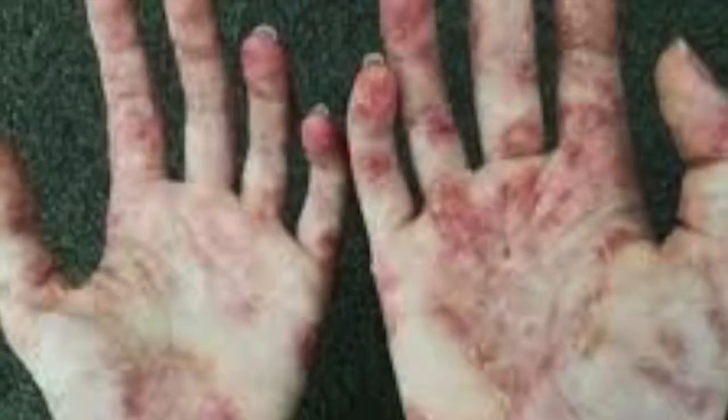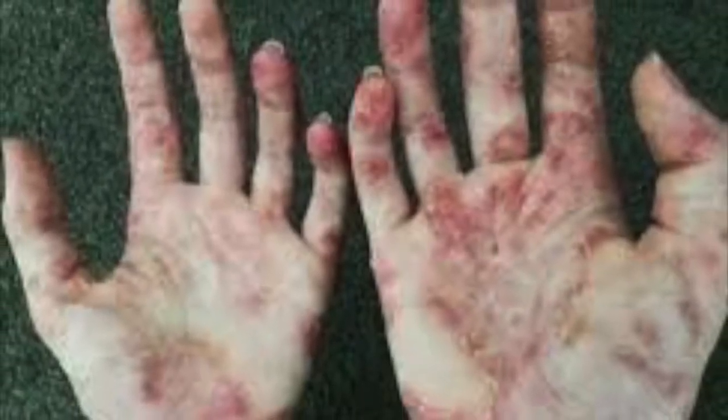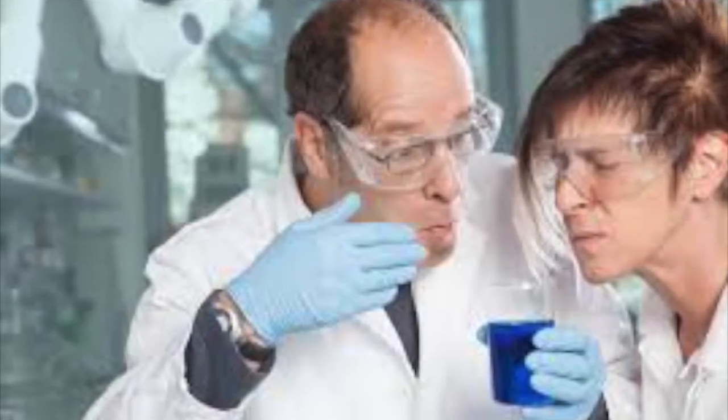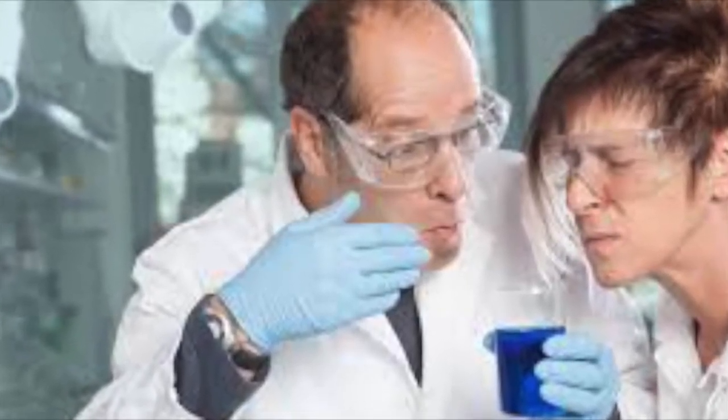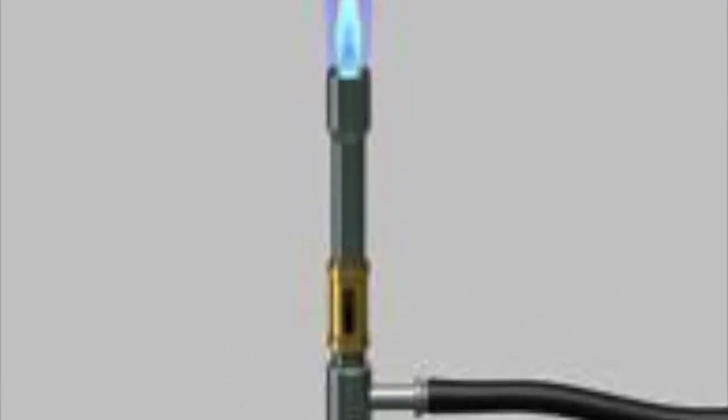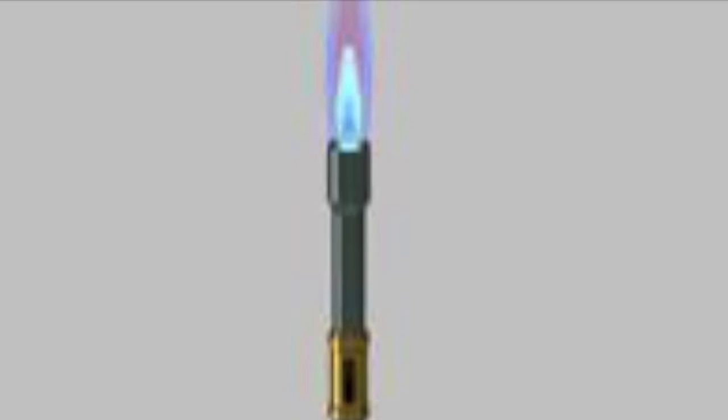If you happen to get chemicals on hands, you must wash off immediately. If you happen to find yourself in a situation where you're smelling chemicals, make sure to use the wafting technique in order to not burn your nasal passage. And as you will probably be using Bunsen burners throughout the semester, make sure that you turn off the main gas, as an uncontrolled Bunsen burner can cause fire to the classroom.